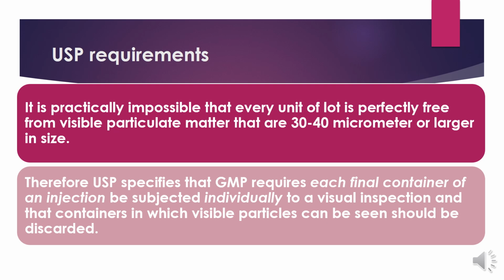Whatever the contents available in those vials, ampoules or containers that have larger visible particles, their content should be discarded, and that shouldn't be processed for further marketing or other distribution areas.